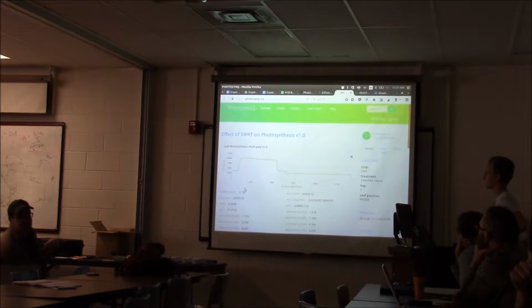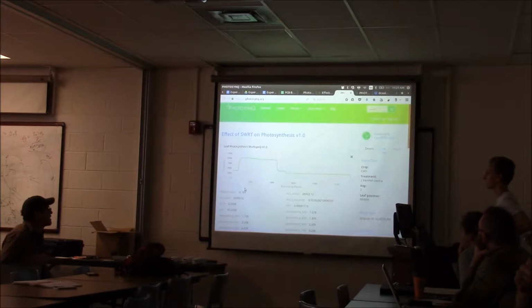We don't know whether this is fully saturated, and in some cases, particularly at high temperature, it might not be fully saturated. So he developed this trick where he went from this saturating light down a little bit, a little bit, a little bit, and he can use this data to extrapolate back and see what it would be like if it's really saturated. And then he put the saturating pulse on again. And then it goes off.